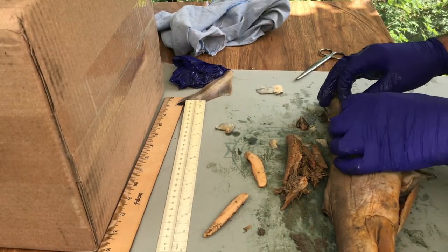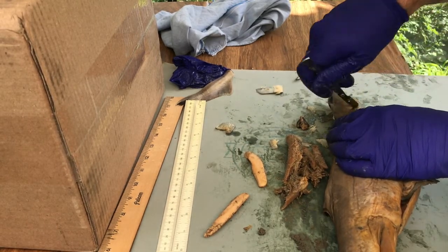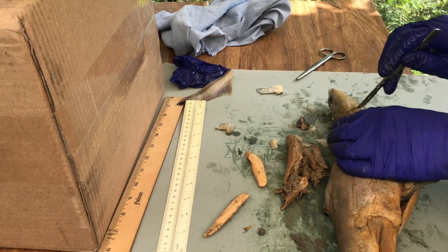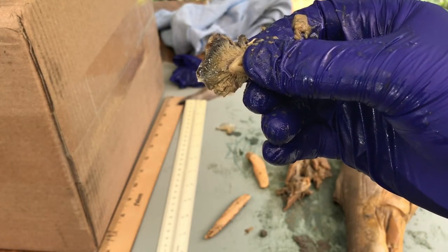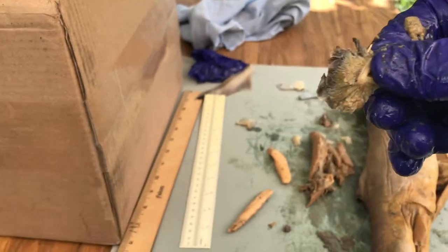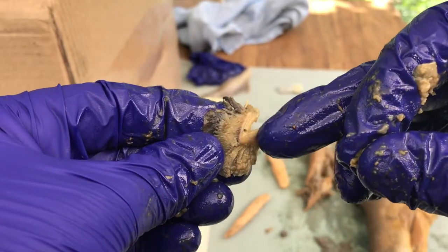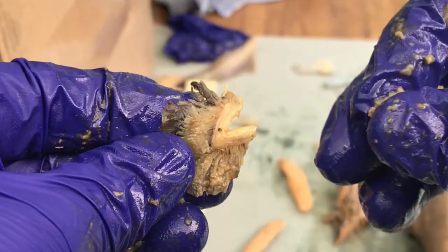Also take a closer look at one of the gills here. So we have these five gill slits, right, which are allowing water to pass out, because water's going to come in the mouth and pass out the gills. Little kind of feathery ends are the lamellae of the gill, and my thumb is on the gill arch. So there's the gill arch, that kind of, well, U-shaped like that.